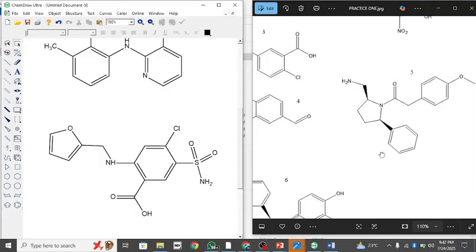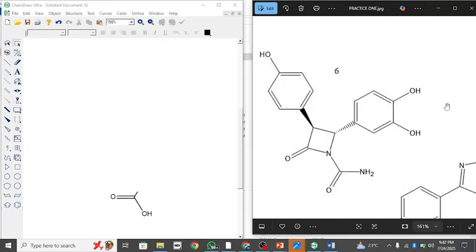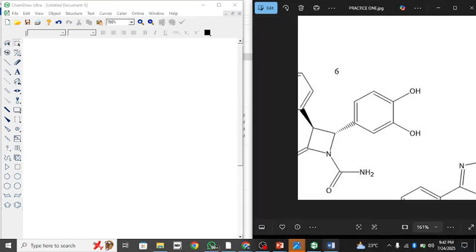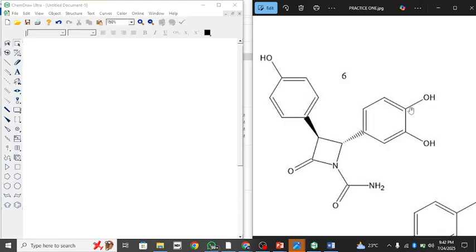Okay, look at this structure. Can you see my screen? Yeah. Okay, so this number 6.